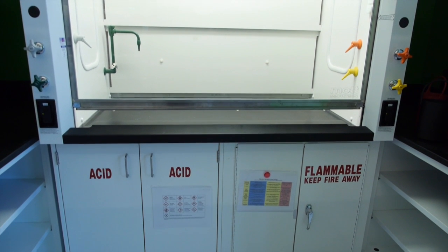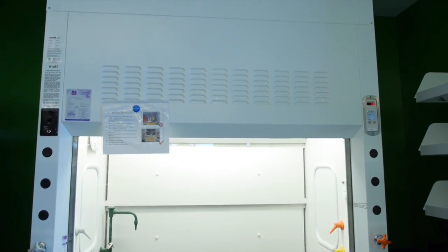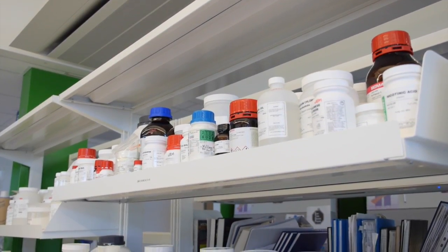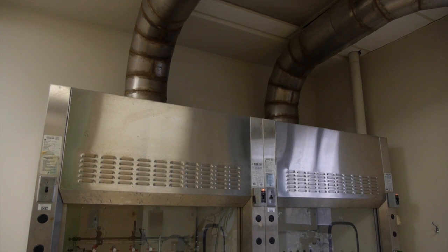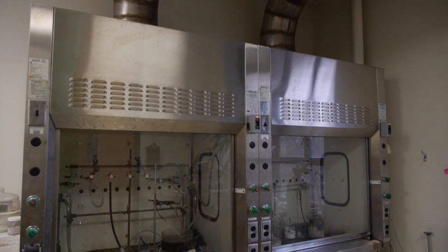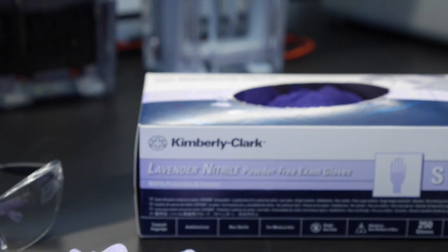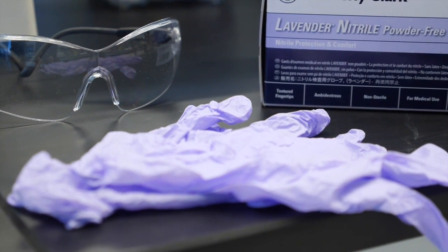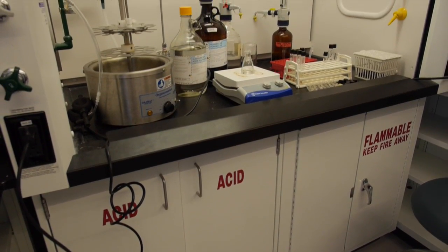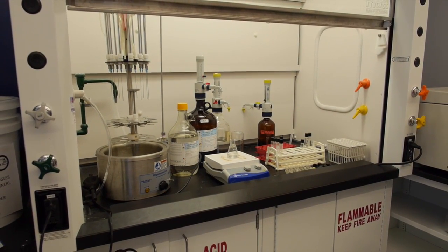The primary function of a laboratory fume hood is to protect the user and laboratory occupants from exposure to chemical vapors, aerosols, odors, and other harmful substances by capturing, containing, and dispersing the materials. The use of fume hoods must still be combined with the use of personal protective equipment, or PPE, as fume hoods alone are not enough to protect the user from all the potential hazardous exposure.